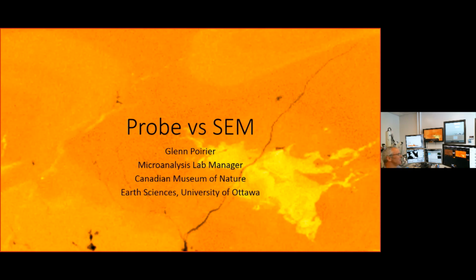What I want to talk to you about today is how electron microscopy, specifically SEM, EDS, and microprobe, can be applied to mineralogy and mineral collection. Ten years ago, I would have given you a completely different talk and told you, SEM, EDS, don't even bother. If you need numbers, go to the probe.